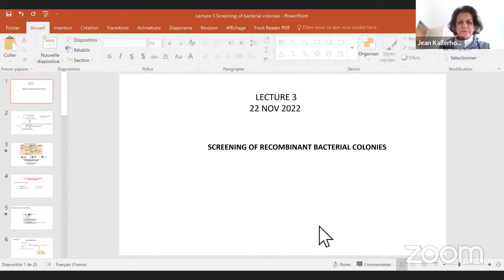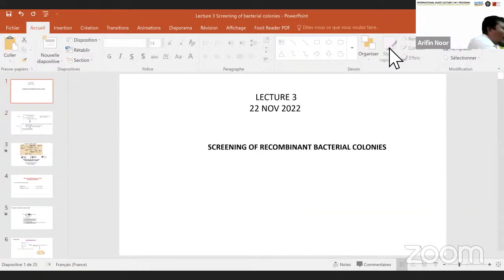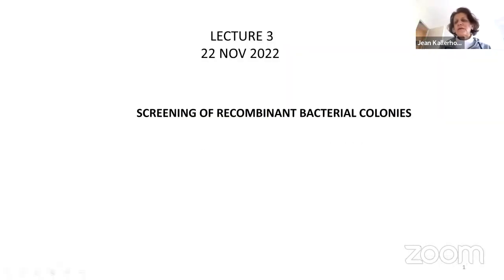So we are going to deal today with the screening of recombinant bacterial colonies. Right. Can you see the screen now, all of you? Yes. Okay, thank you.